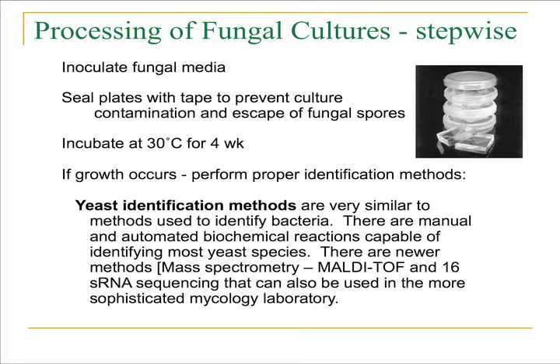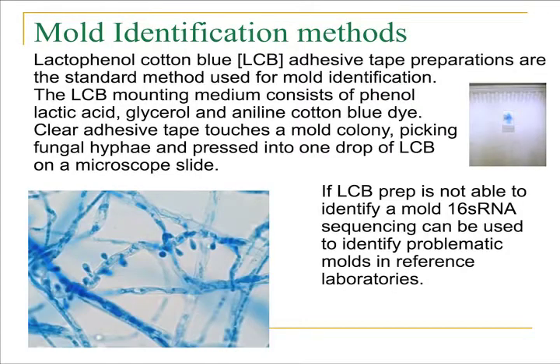Mold identification is discussed on the next slide. It's very different than the yeast identification. There are not magic biochemical panels or anything that you can use for molds. So what we commonly use to identify the molds is called the lactophenol cotton blue adhesive tape prep. This is the standard method that's used in most laboratories for mold identification.